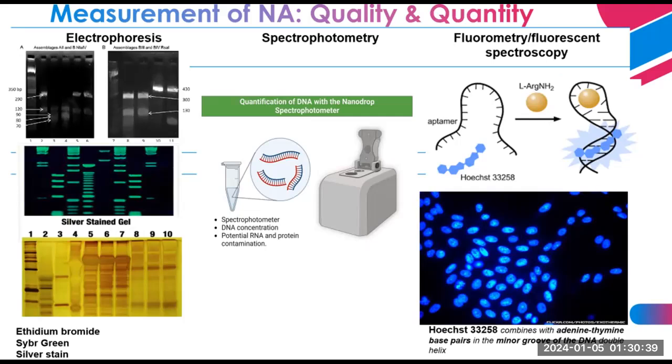These dyes are widely used in cell biology and molecular biology research for visualization, and aside from visualization, there is quantification of DNA content in cells. Additionally, Hoechst dyes are employed in DNA staining protocols for distinguishing between live and dead cells, or identifying nuclear morphology in cellular studies.